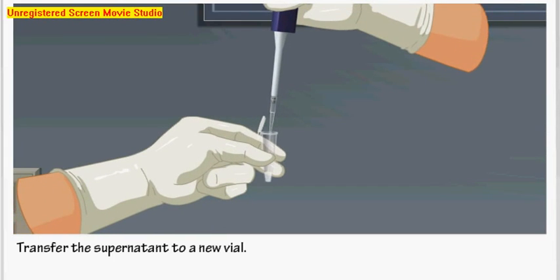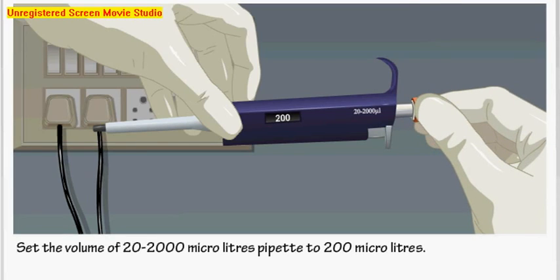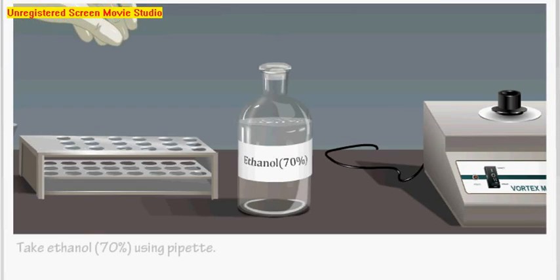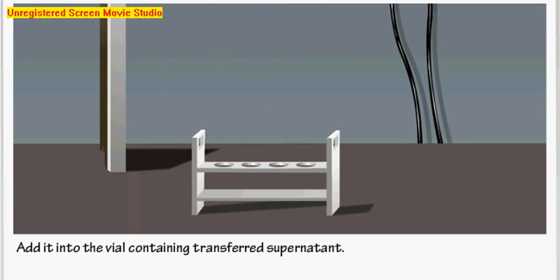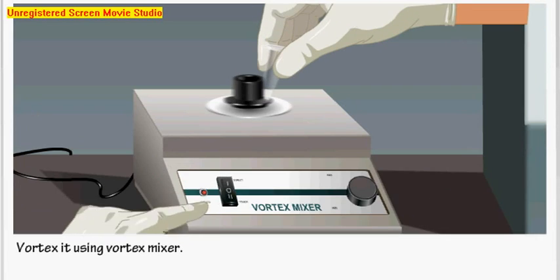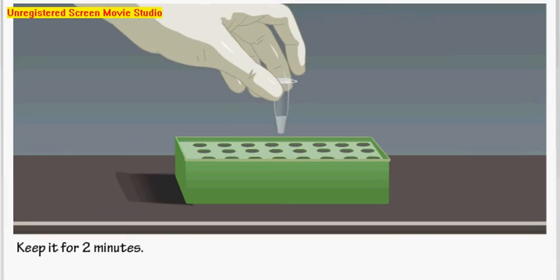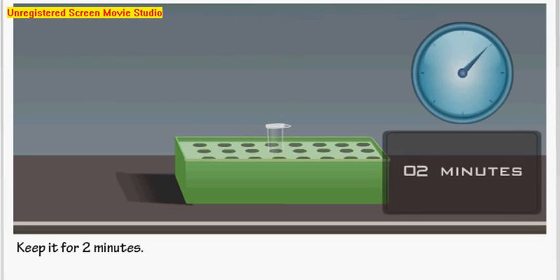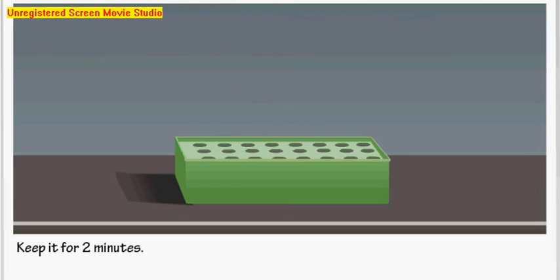Set the volume to 200 microliters. Take an appropriate pipette tip and take 70% pure ethanol using the pipette. Add it into the vial containing the transferred supernatant. Vortex it using the vortex mixer. Keep it for 2 minutes at room temperature, then centrifuge it at 5000 rpm for 5 minutes at 4 degrees Celsius.